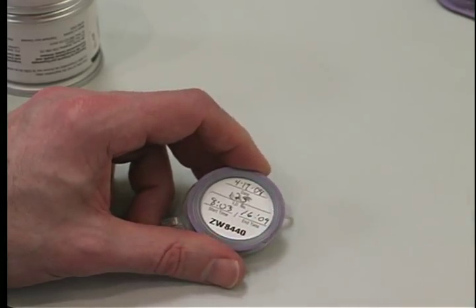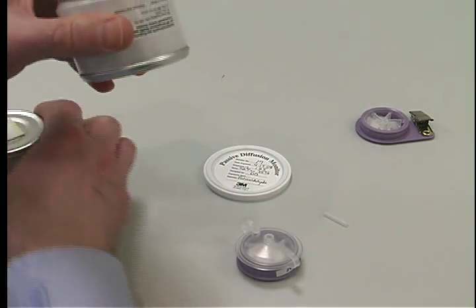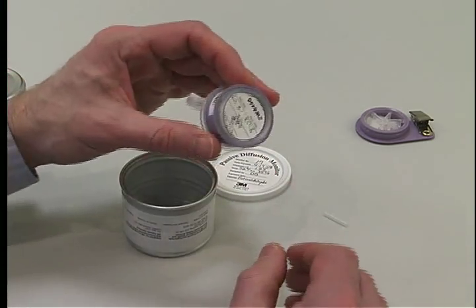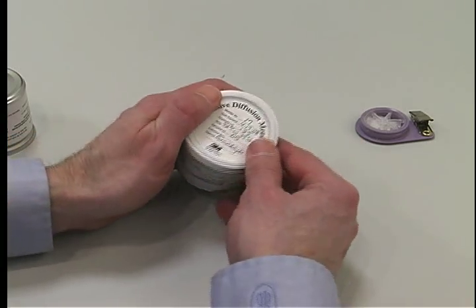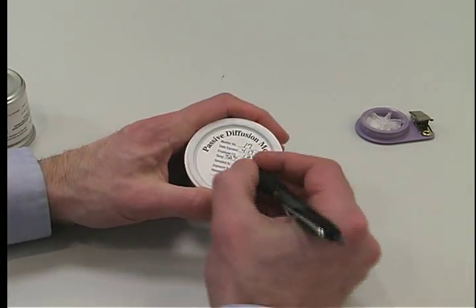Add the stop time to the label. Return the sealed monitor section and the short plastic straw to the can and close it with the white plastic lid provided. Put the exposure time on the white lid.